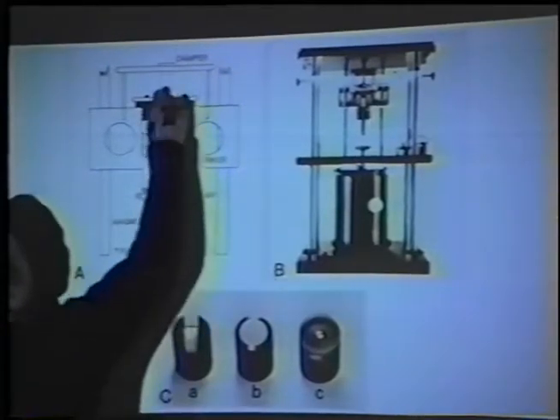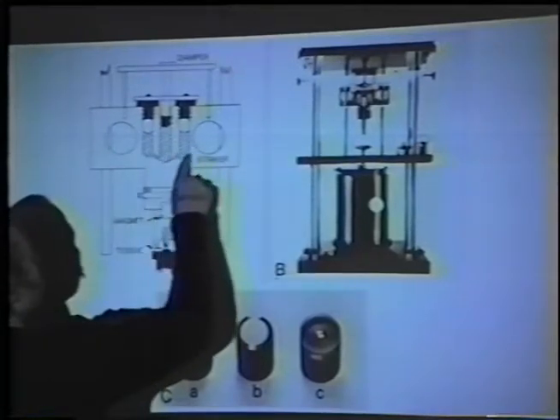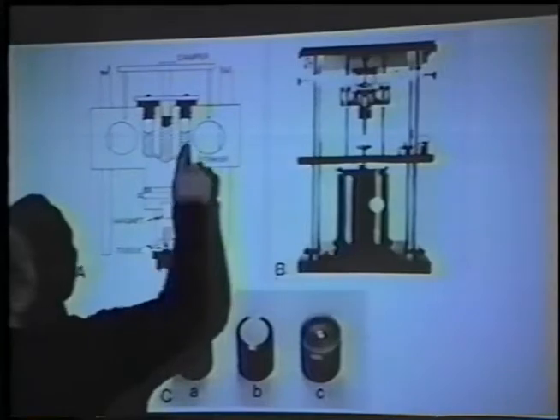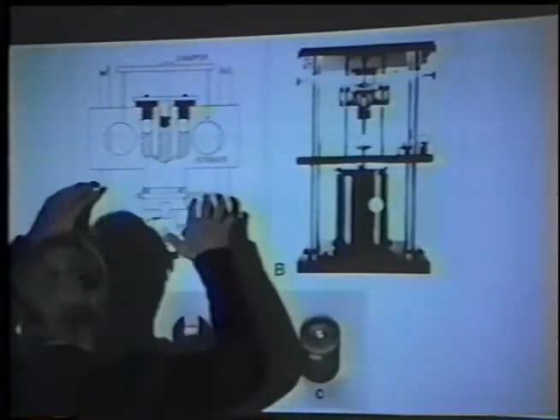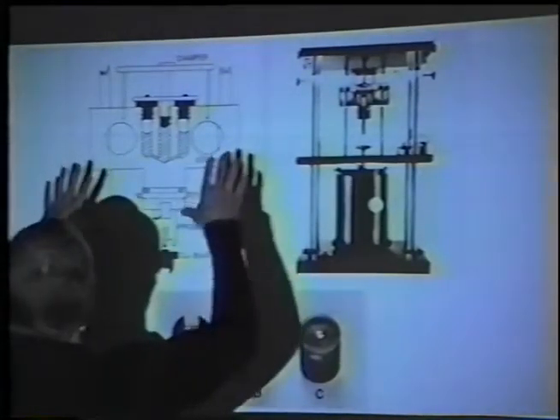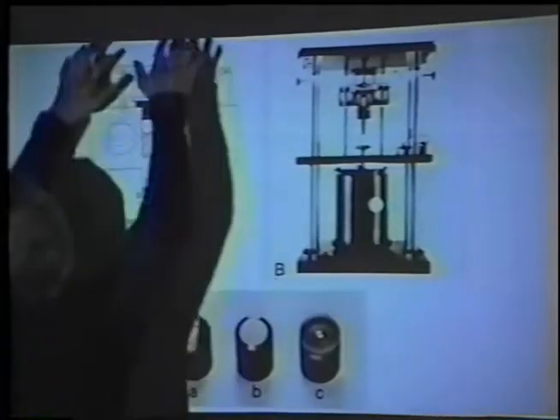This plunger pushes on a column of glycerol, which has passageways leading to two other compartments in which there's glycerol and air. When the striker comes down, the probe hits the copper block, and the striker stops. The rebound is prevented because the damper keeps moving.